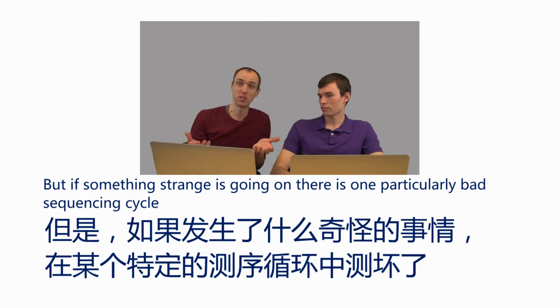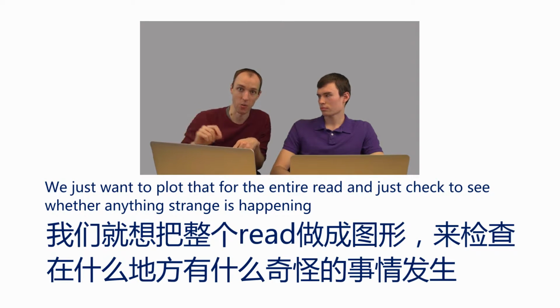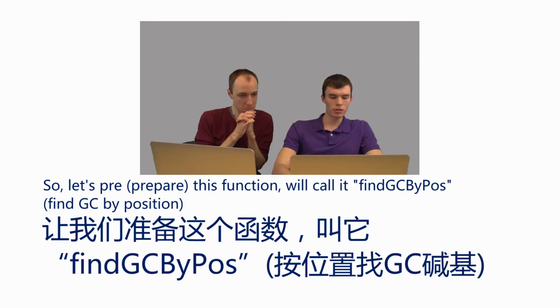But if something strange is going on, like if there was one particularly bad sequencing cycle, then we might see a very different mix of Gs and Cs relative to the other bases. So we just want to plot that for the entire read and check to see whether anything strange is happening. Okay, so let's create this function.